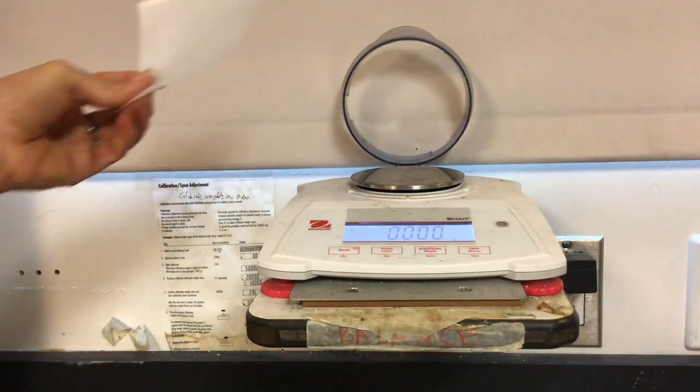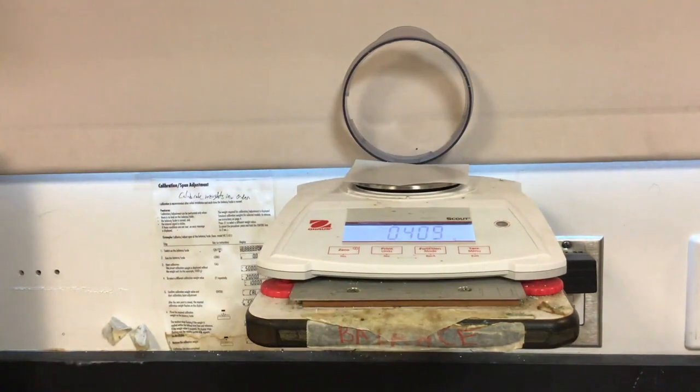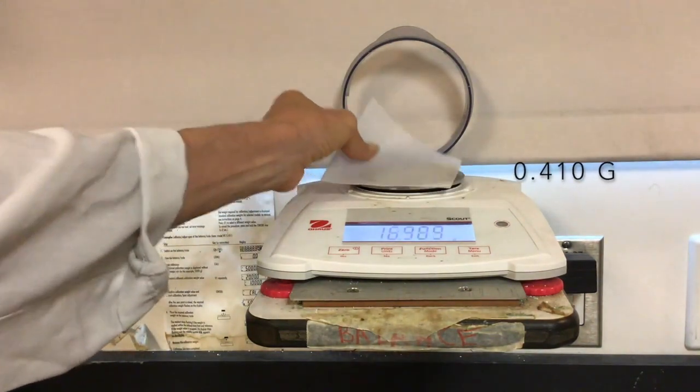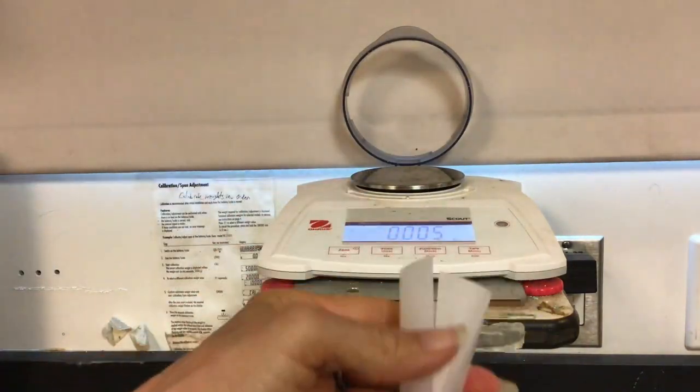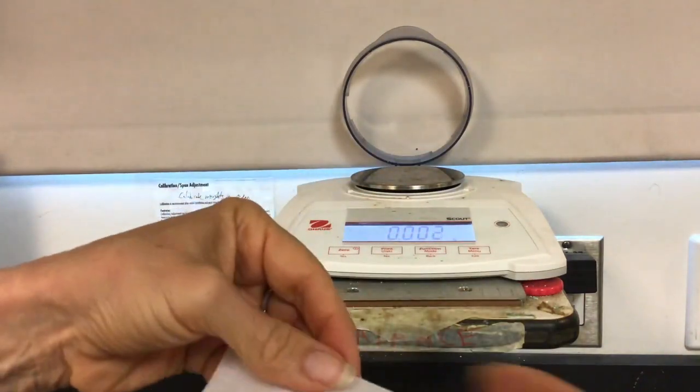I'm going to start by weighing my weighing paper, and that weighs 0.410 grams. I'm going to fold my weighing paper into quarters so it can make an indentation at the bottom.